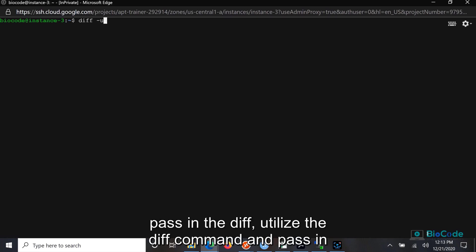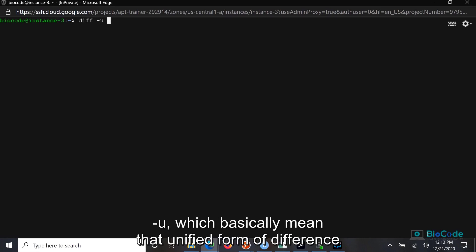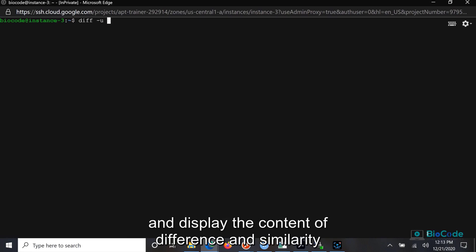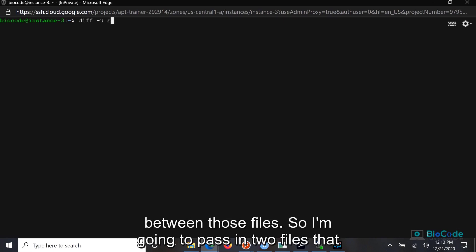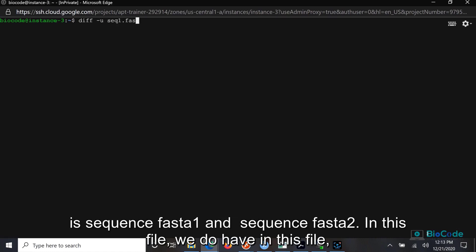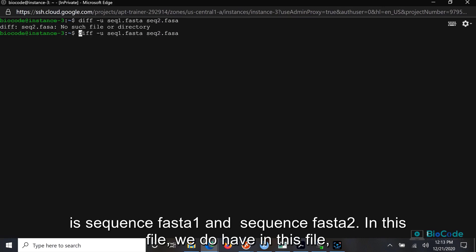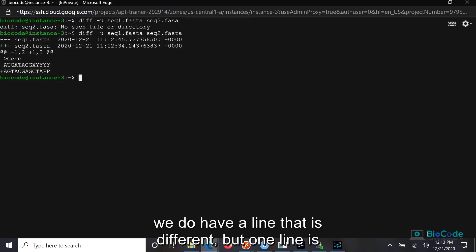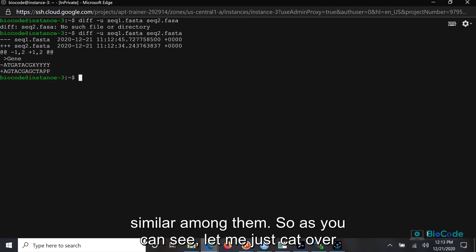You can utilize the diff command and pass in the -u flag, which means the unified form of difference between two files. It will compare those files line by line and display the content of difference and similarity between them. I'm going to pass in two files: sequence_first_one and sequence_first_two. In these files, one line is different and one line is similar.